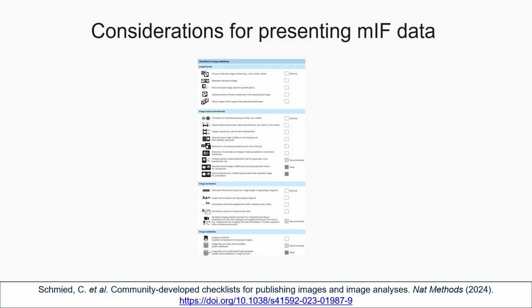Remember that figures are not simply illustrations, they are scientific data and should be treated with the same level of care as any other experimental result. We won't be going through everything in this list, and we can consider further modules after this workshop to go through how we can address each of these.